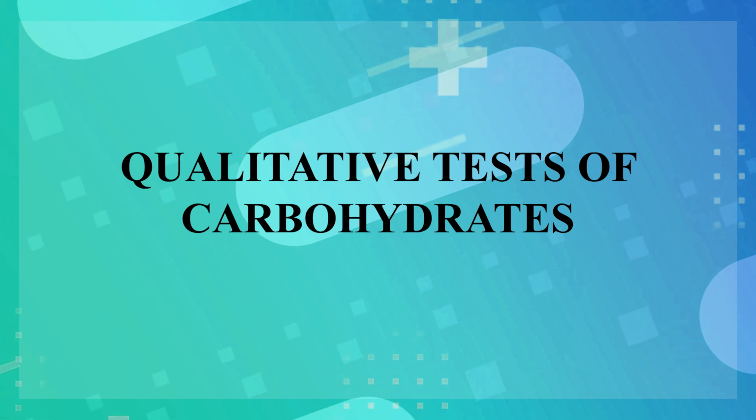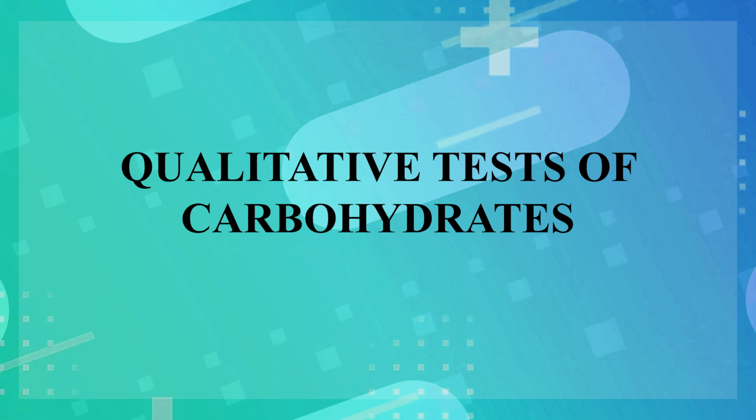Hello everyone, myself Dr. Sunaina Rathi, instructor for the course Biochemistry. Through this video, we are going to demonstrate the qualitative tests for carbohydrates, amino acids and proteins. So first, we are going for qualitative tests of carbohydrates.